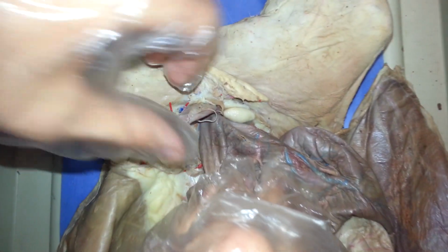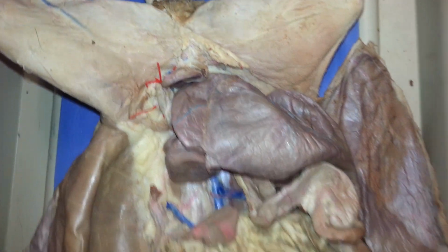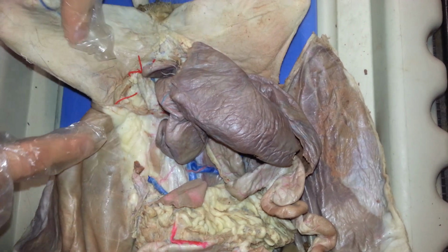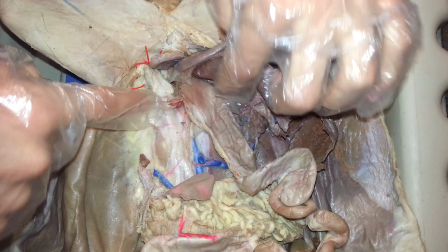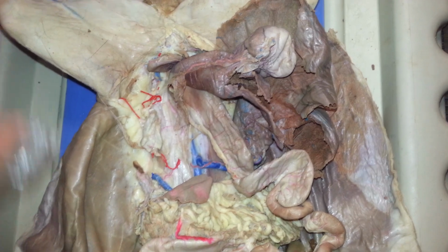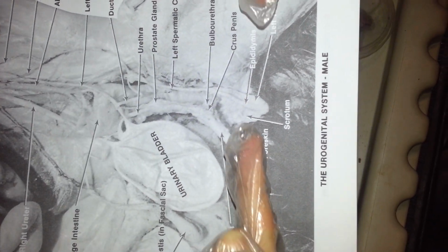And next is the bladder. We're going to come down here, and it's this flap that's right here. The uterus, in this cat, this is the pregnant cat, so all of this is the uterus itself. But in a non-pregnant female cat, you would have a horned uterus that would run along the side right here. Next is the penis, and the penis is located in the most inferior part, and below the penis is the testes that are on the sides each.